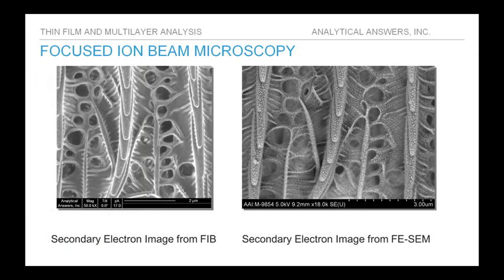An example is shown here — a high magnification image of the scale on a butterfly wing. On the left is the secondary electron image formed using the FIB tool, and on the right is the secondary electron image from the same field of view using our field emission SEM. While the resolution is not quite as good in the FIB tool, you can clearly see fine detail well below micron resolution, sufficient to get an overall impression of the surface structure and navigate to areas of interest.